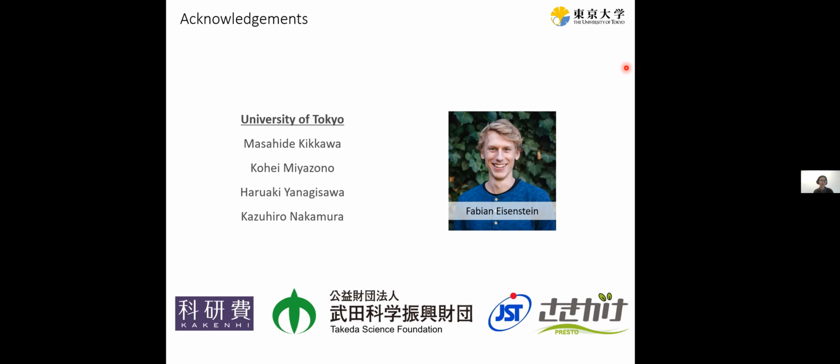Cool. Isabel, did you want to ask a question? Sure. Very nice work, Rado. Really, really amazing amount of structure you are showing us here. My question was regarding when you evaluate the resolution and indicate the performance factors that improve your resolution. If you use the shell correlation, you are really comparing the consistency of the data. And if you see an improvement of 0.2 angstrom, is it really meaningful? Or is it just because the data is a bit more consistent because, for example, you have more dose? I wonder if you could comment on that.